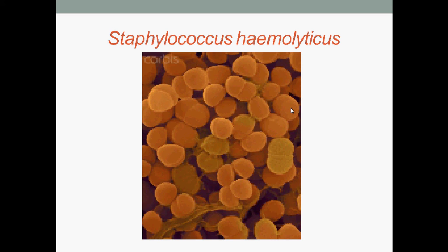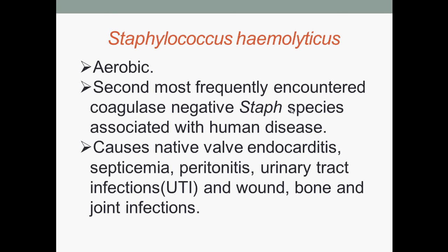Staphylococcus haemolyticus under microscopic view. Staphylococcus haemolyticus are aerobic. They are the second most frequently encountered coagulase negative Staphylococcus species associated with human diseases. They cause native valve endocarditis, septicemia, peritonitis, urinary tract infections, and wound, bone and joint infections.